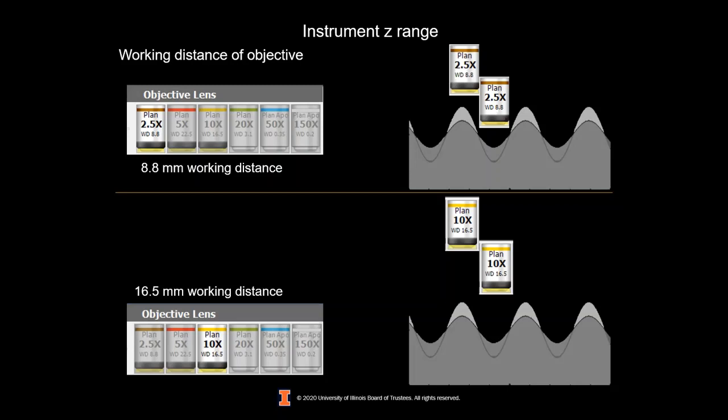We have a pair of questions here concerning instrumentation. One is, can you comment on the accessibility of different techniques and how much they cost? And the second, is it possible to do Raman and photoluminescence with these types of 3D optical profilers? Okay, so of all the ones that we saw, one of them could do fluorescence at the same time that you do optical profilometry, and that was Zeiss.